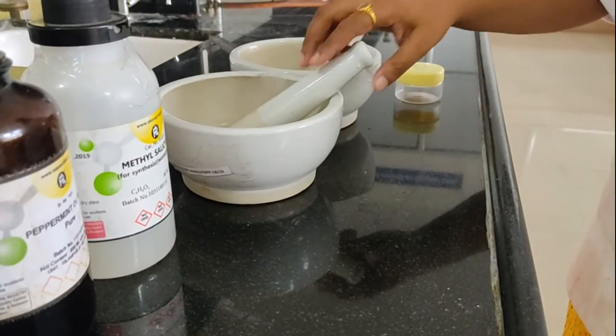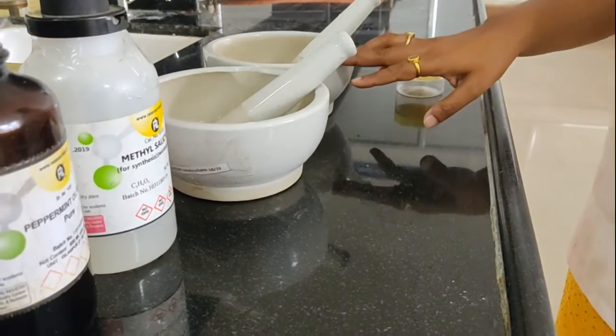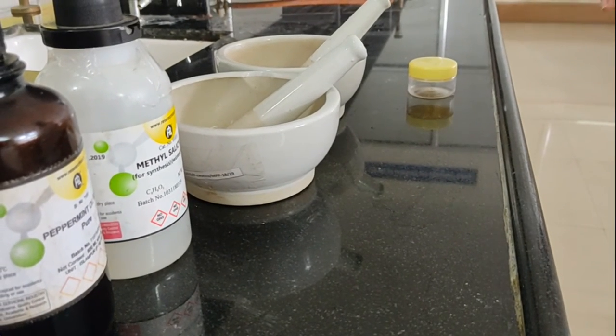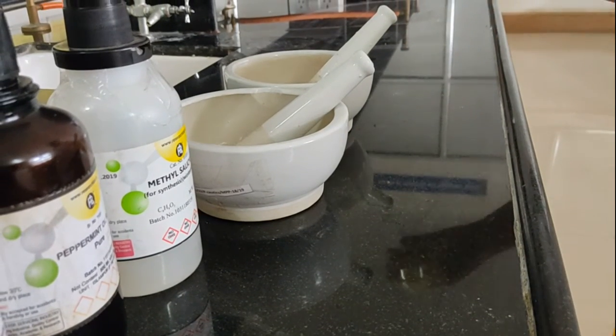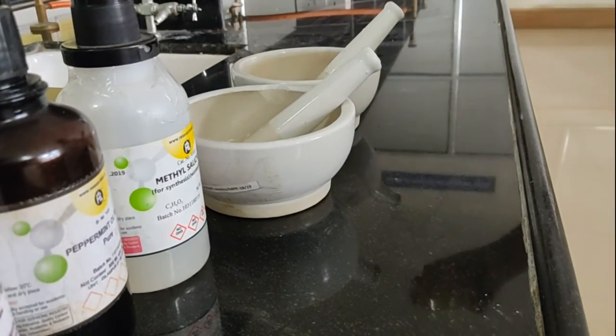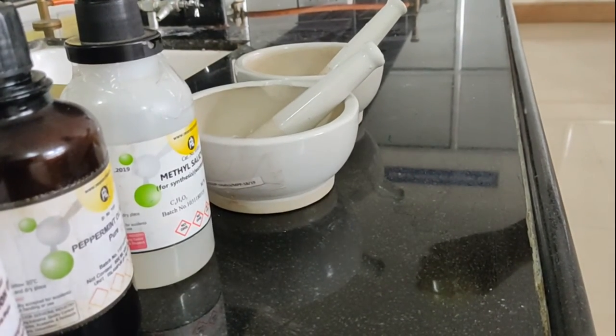Then after proper mixing of both halves in the two mortars, now I am going to pass this powder through the sieve, and after sieving, we will fill the powder from both mortars into a dry container, and then we will proceed to the next labeling part.